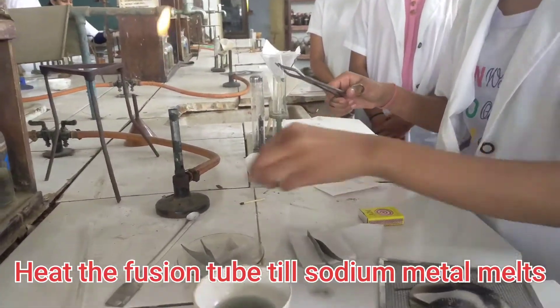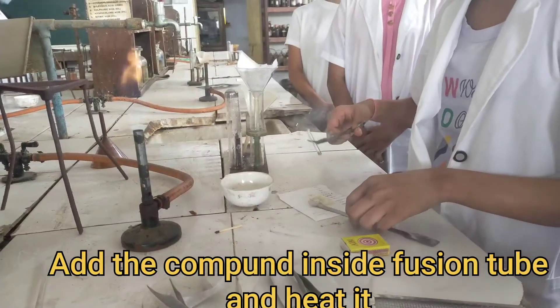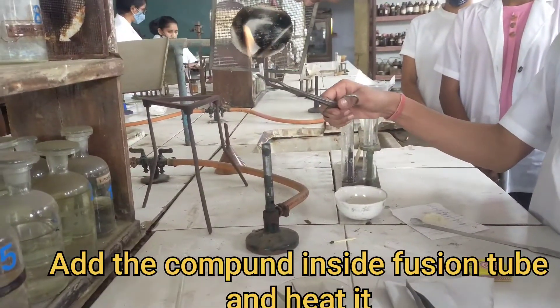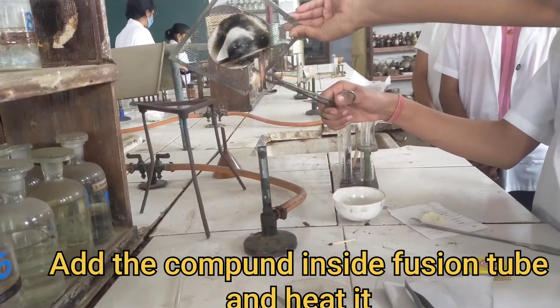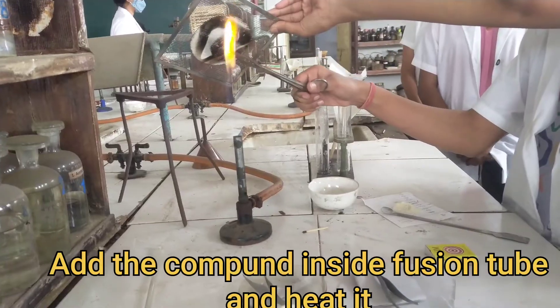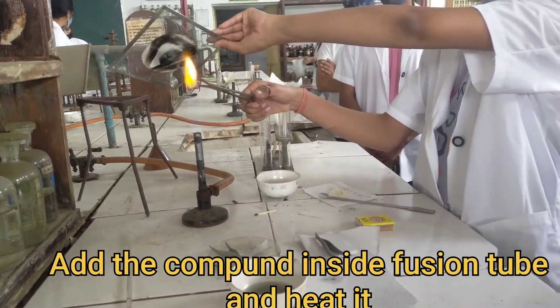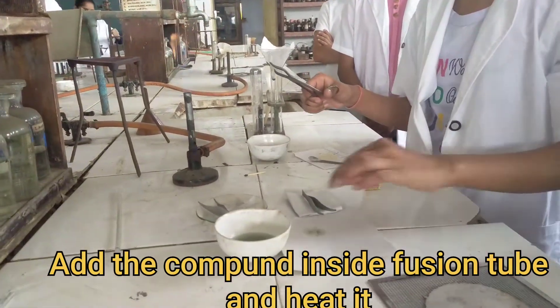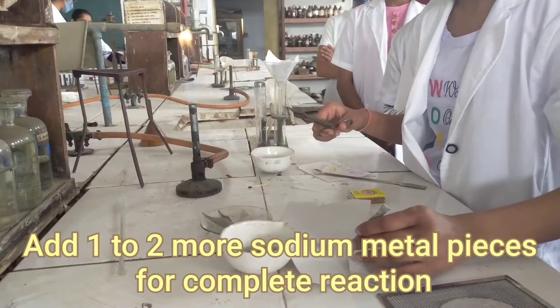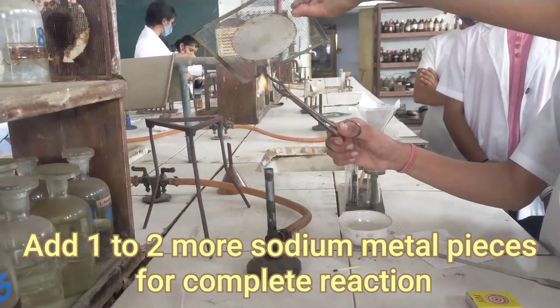Now, add our compound inside this fusion tube. This is our unknown compound and we have added it. Again, heat it so that the sodium metal reacts with our compound to form ionic inorganic substances. To get the reactions proper, add some more sodium metal pieces so that the reaction becomes complete. Again, this dry sodium metal piece we enter inside the fusion tube and heat till it becomes red hot.